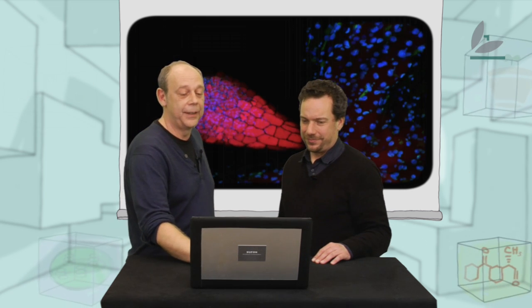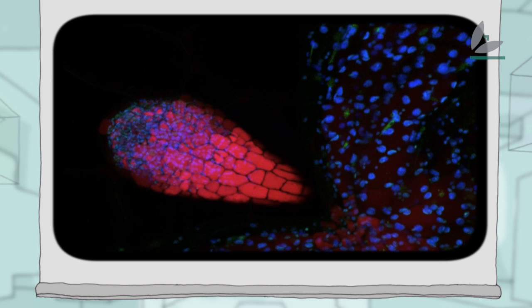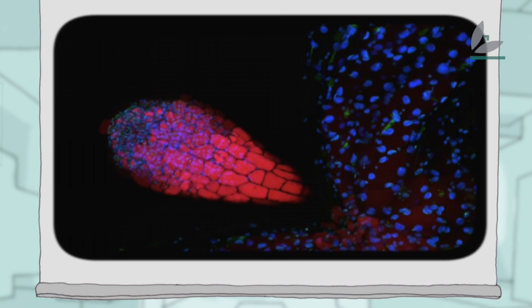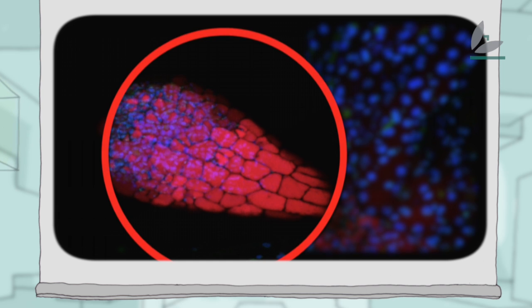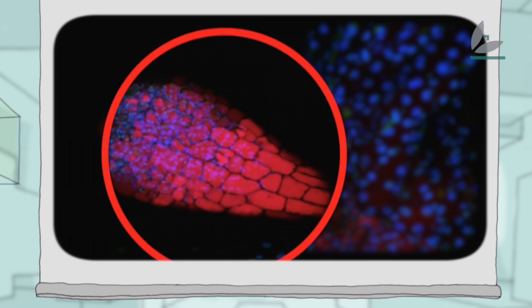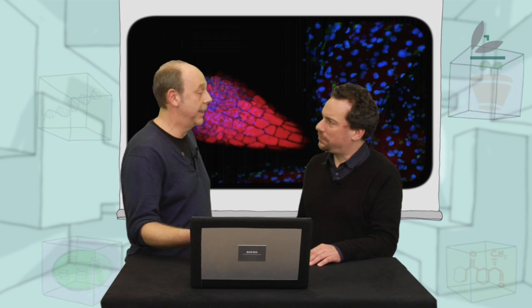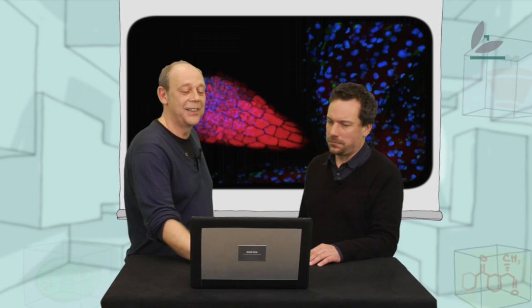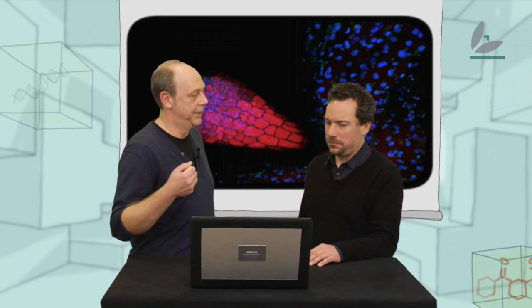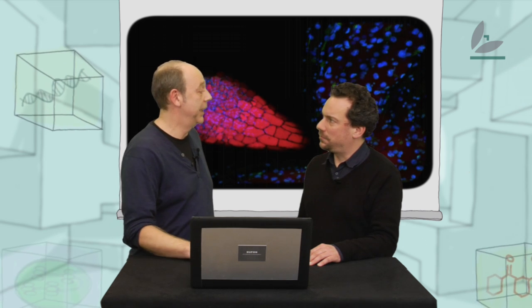Okay. And the last picture? The last picture shows a very young leaf emerging between the cotyledons in the young seedling. So this is the young leaf. This is the young leaf. And you see here a red signal. It's a stress signal, and it's called anthocyanin. And it's produced in stress responses by the plants. So this leaf has stress right now?